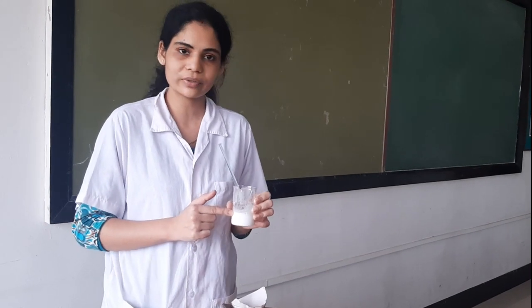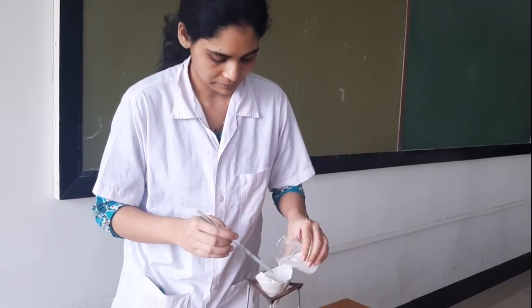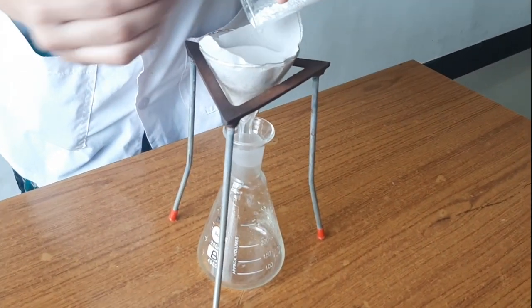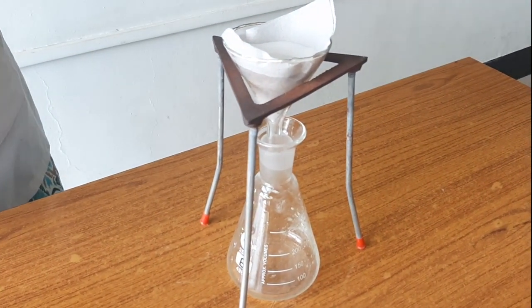Now we are doing the last part of part B, and that is we will be passing the 15% suspension of calcium carbonate through this filter medium, and we will be checking the time which will be required for complete filtration. Now we have started the time, and we will check what time is required.